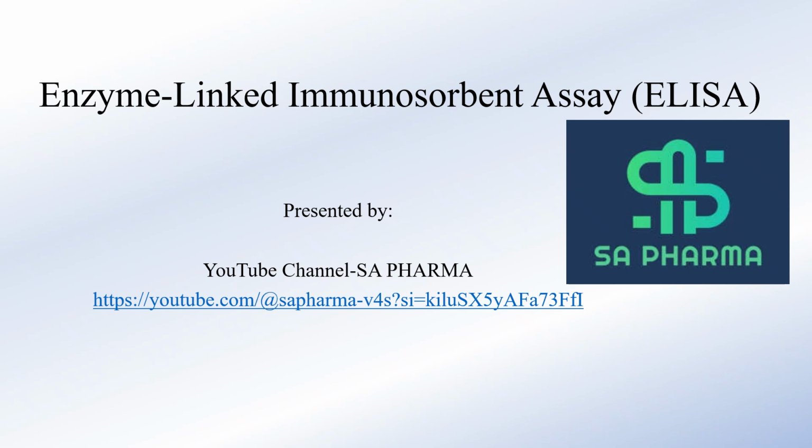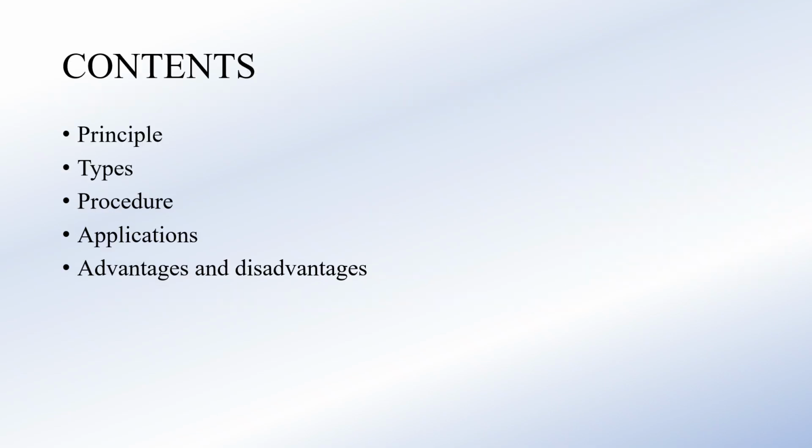Today we are going to discuss the ELISA assay technique. ELISA, that is enzyme linked immunosorbent assay. The contents of today's presentation are: we are going to see the principle, types, procedure, application, advantages and disadvantages of ELISA assay technique.